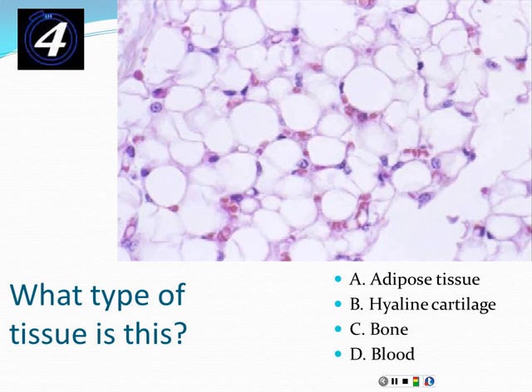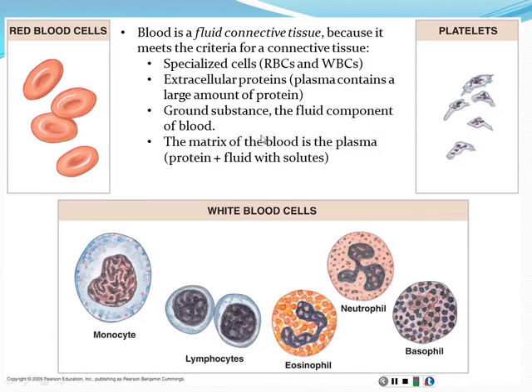Okay, so this is adipose tissue. Classic pattern recognition. You see under the microscope, when we look at adipose tissue, all we see is the skeleton of the cell, so to speak, because the fat that would normally occupy these empty spaces gets removed when the tissue is processed for light microscopy. So we end up with these little cavities here, and this is adipose tissue. All right. One of the least popular tissues in the body.